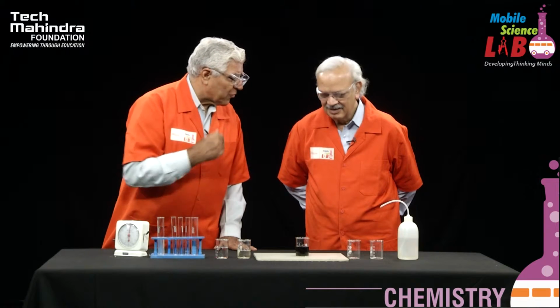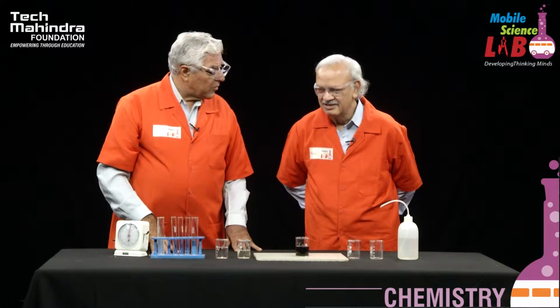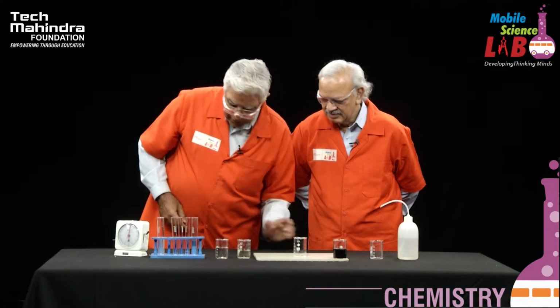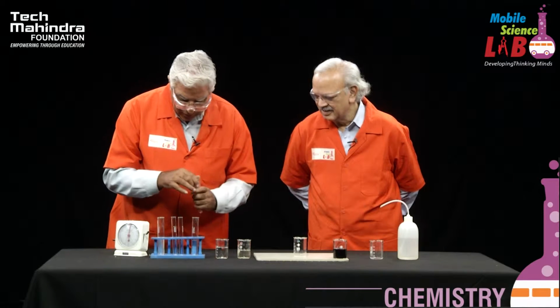Sir, will you please explain? Yeah, I'll do that. We'll do it in smaller steps, like what is happening at each stage. Now take just persulfate and iodide. All right. Shall I remove this? Just keep it on the side. I'll put one more beaker here. And now you can take it in smaller test tubes.